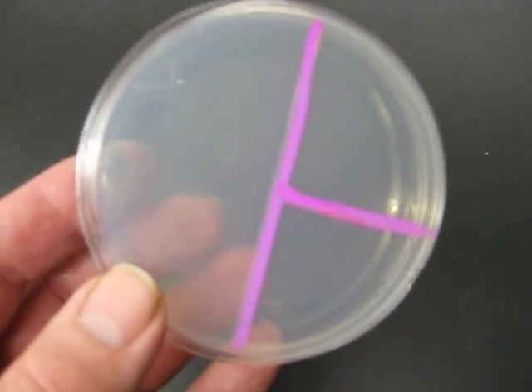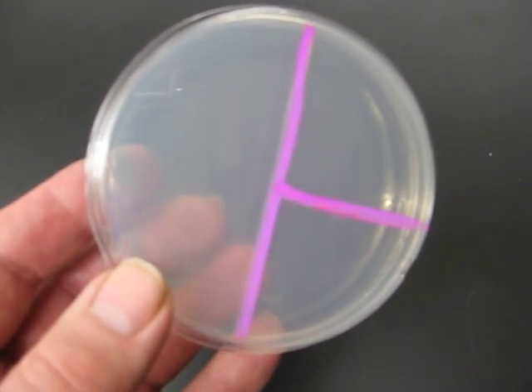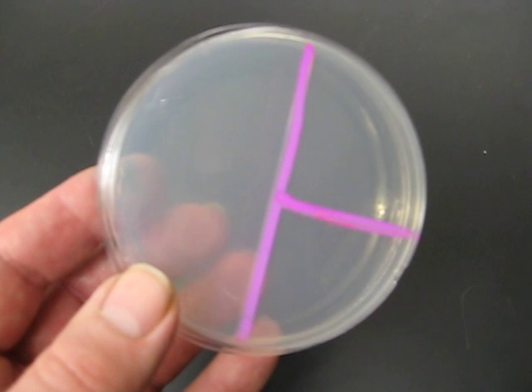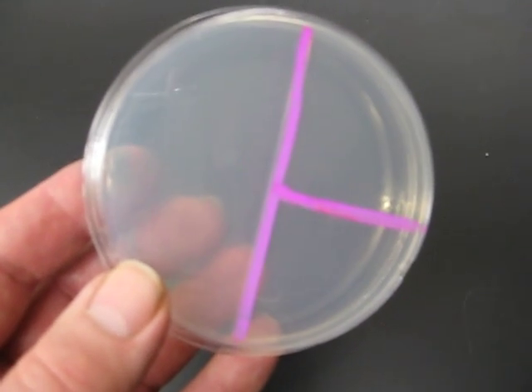Going back to the beginning, it can be handy to draw some lines on the bottom of the plate to delineate the three phases of our streaking process.